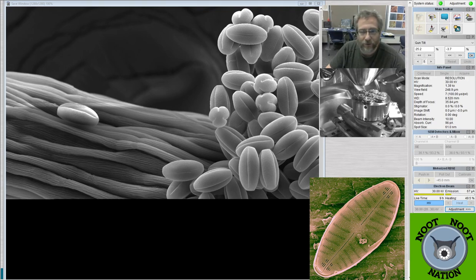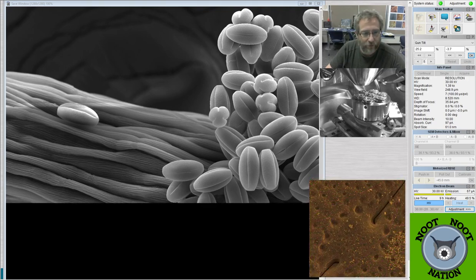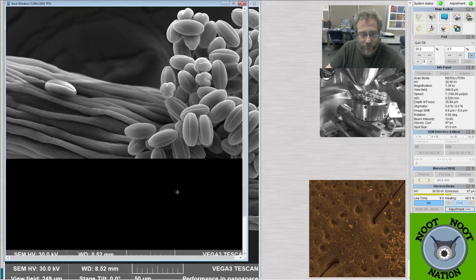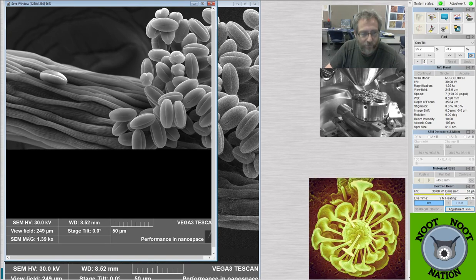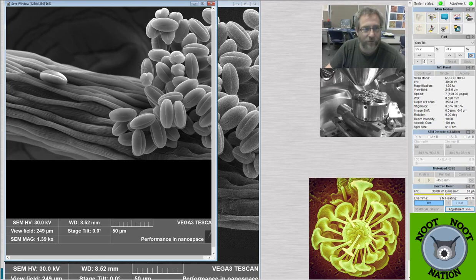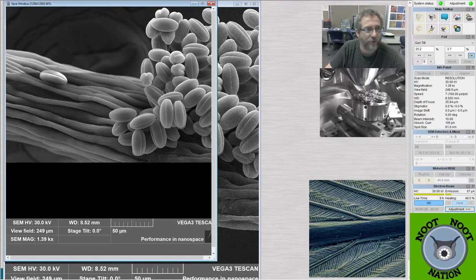Yeah, so if you wanted to know exactly how big it is, there's a scale bar at the bottom. The SEM always has a scale bar sitting right there, and it will also tell you on the image what the field of view width is. If you really wanted me to zoom in and measure it, we could. We don't even need to zoom in to measure it. I have measurement tools on here.